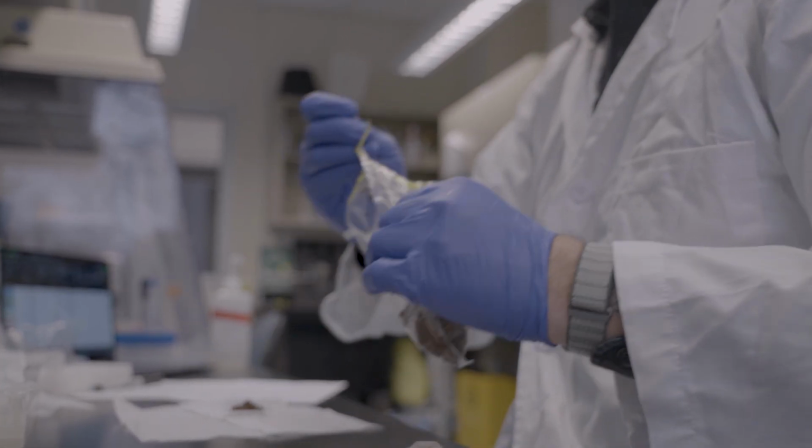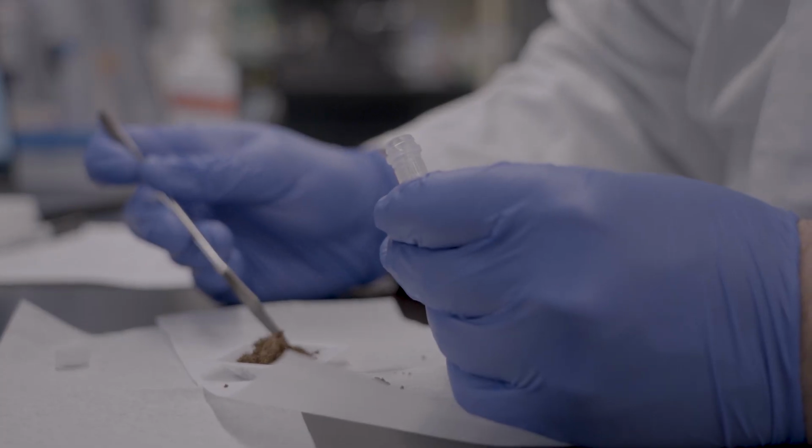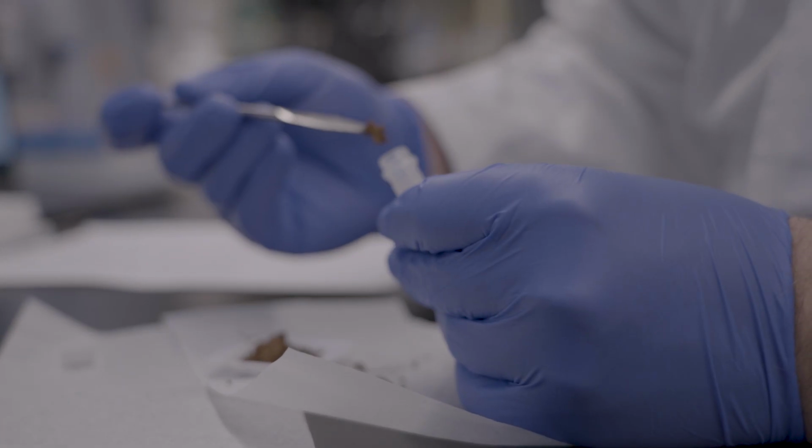So we do a bunch of different steps to take the soil and remove everything we don't want, like the little particles of sand or clay or whatever is in there, and we pull out just the microbial DNA, bacteria and fungal in particular for this project.